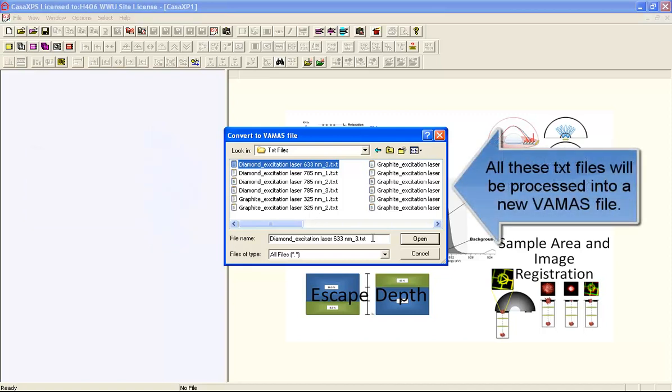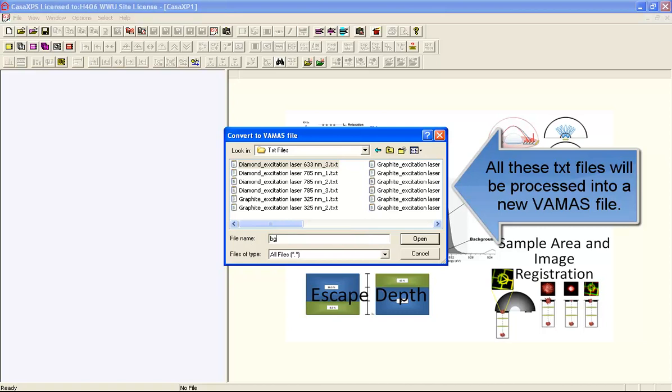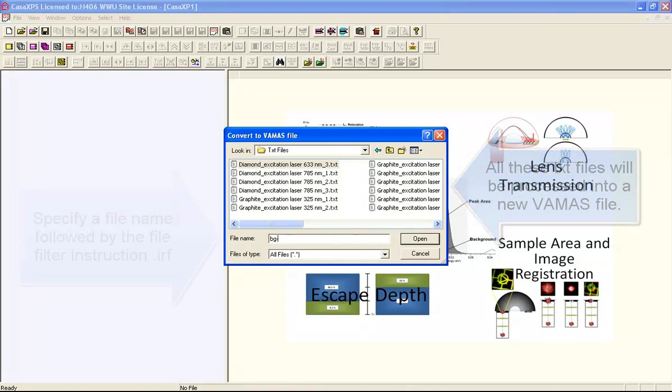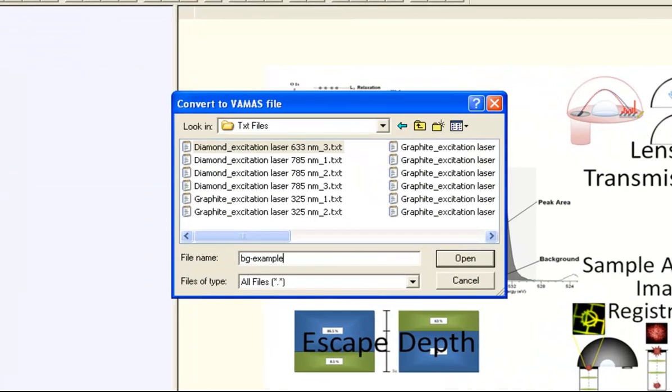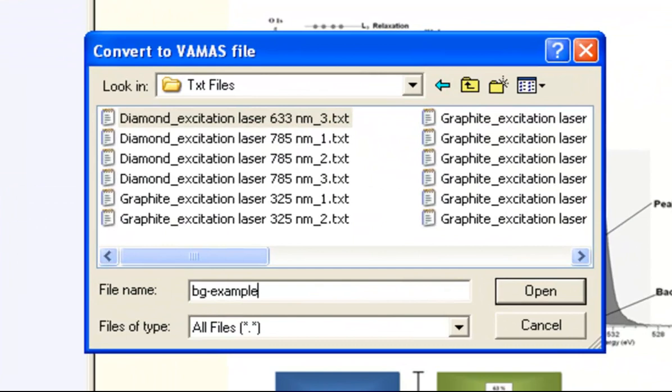I can do this by entering a file name. This is the VAMAS file name that will be generated.